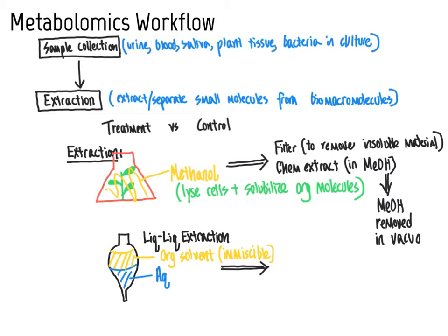So after the liquid-liquid extraction, generally what happens, analogously to the extraction of cell systems in methanol that we saw up top here, is that the organic solvent is removed in vacuo, leaving us with a dried residue of the organic compounds. And the organic solvent that is selected here can be a variety of different solvents. The main criteria is that it can't be able to form a single solution with water.